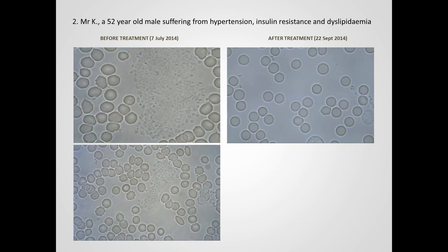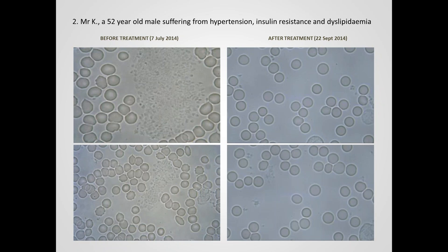All right, the same example here. Also another group of thrombocytes visible in the image on the left-hand side, and the degree of improvement there. We can actually see a very small group of thrombocytes on the right-hand side image here. Now this compared to the red blood cell is still approximately the same size as a red cell, so this would still be considered a relatively low grade finding.